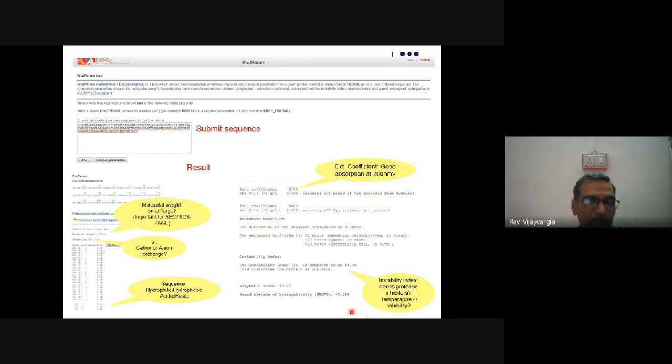Also, this tool will tell about the instability index, whether the protein is susceptible to protease. Then you have to add protease inhibitor in the buffer. If it is susceptible to high temperature, then you have to maintain low temperature during purification. Also, the pH stability: you have to use the right pH so that the protein remains stable. All this information you can gather by just having the sequence of the protein, and it will help you design a good strategy for the purification of the protein.